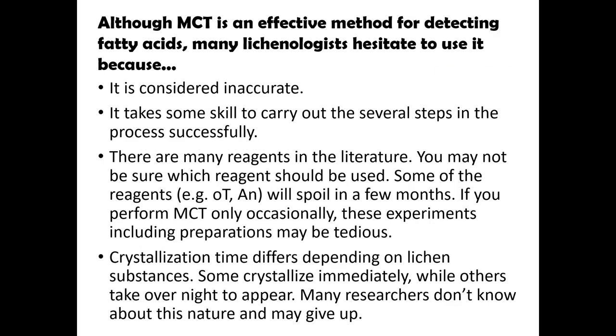Although the microcrystal test is an effective method for detecting fatty acids, many lichenologists hesitate to use it because it is considered inaccurate. It takes some skill to carry out the several steps in the process successfully. There are many reagents in the literature. You may not be sure which reagent should be used. Some of the reagents, for example, ortho-toluidine and aniline, will spoil in a few months.